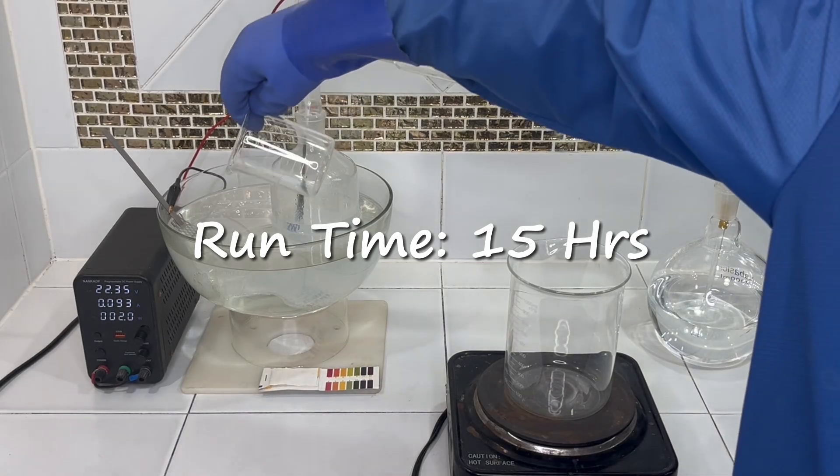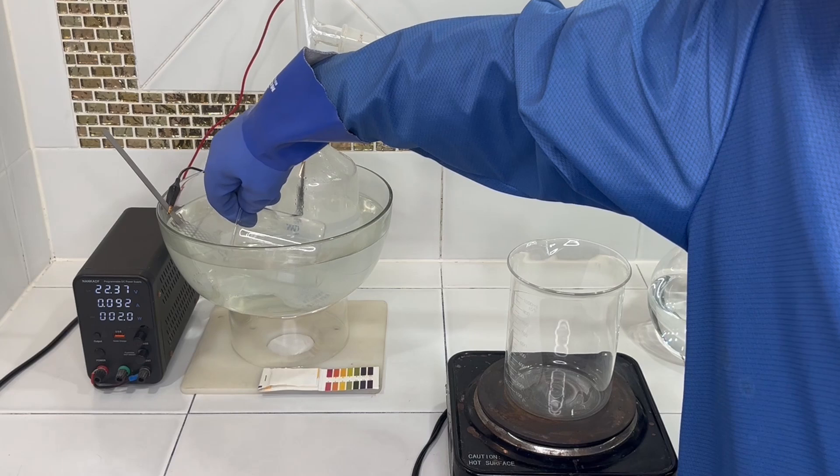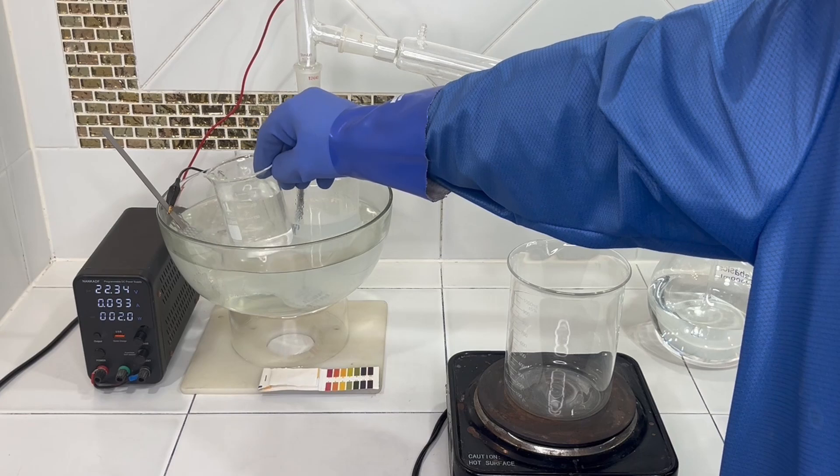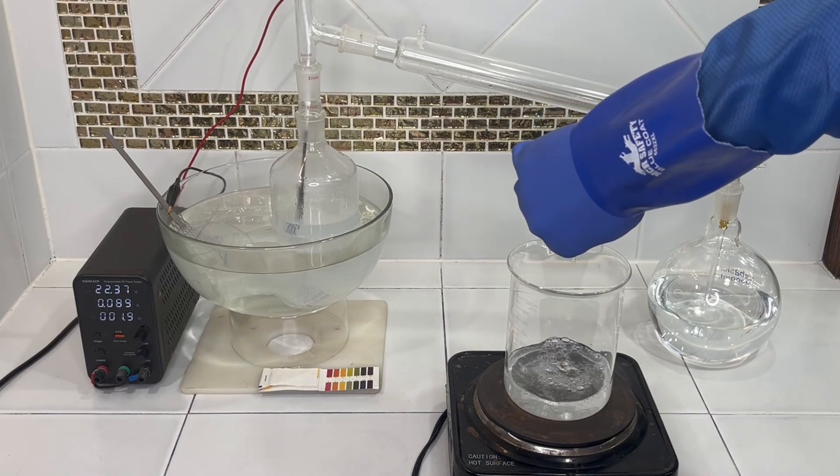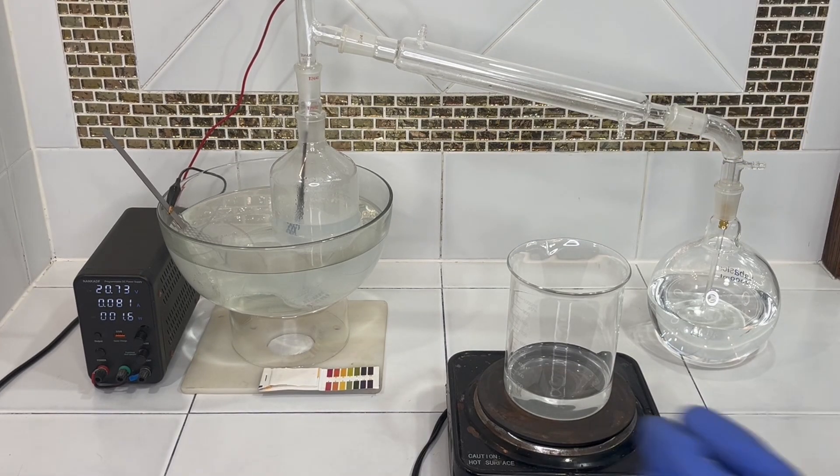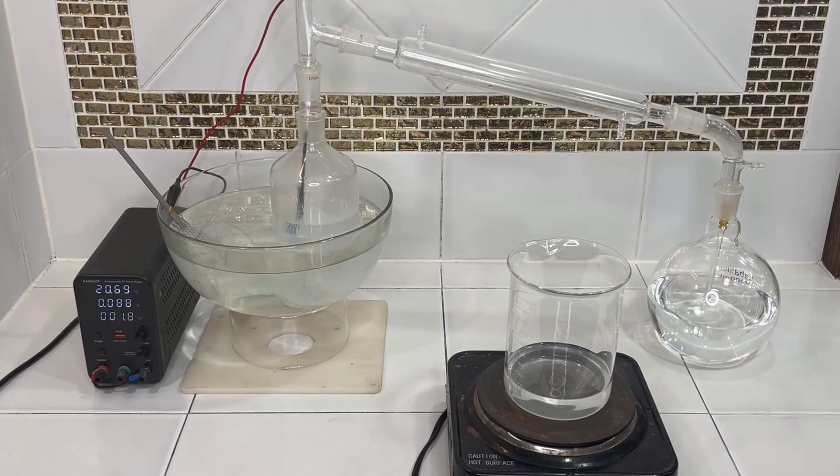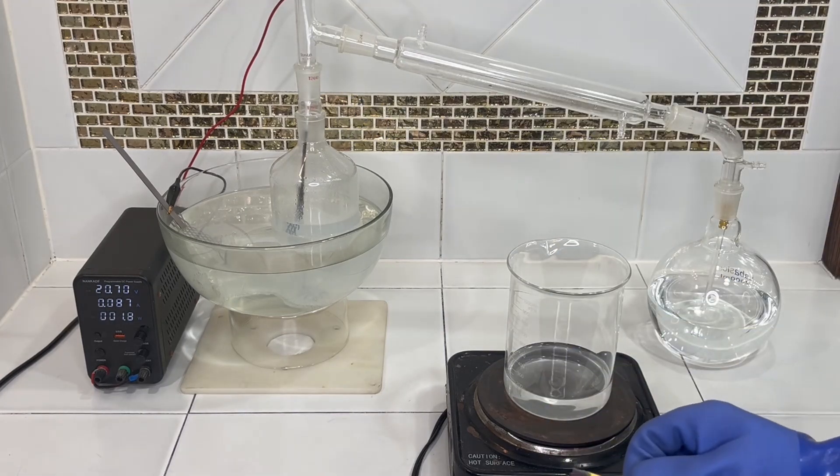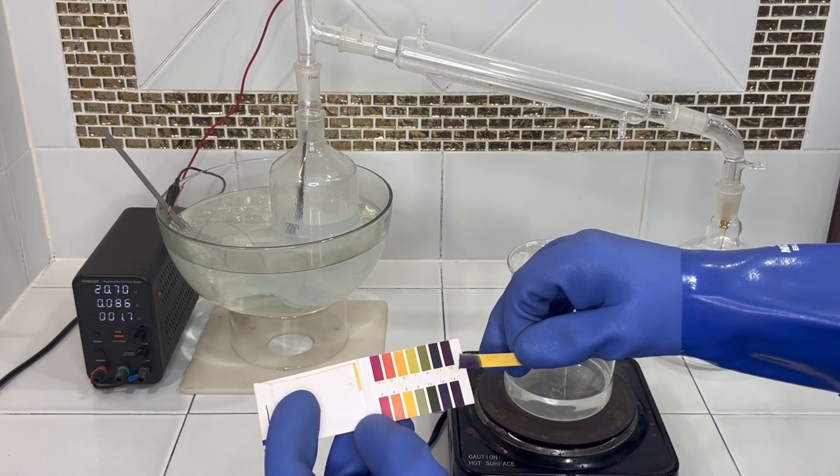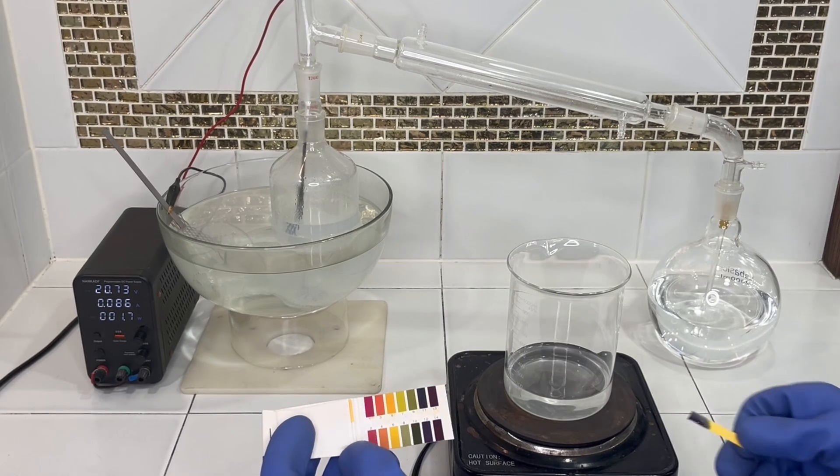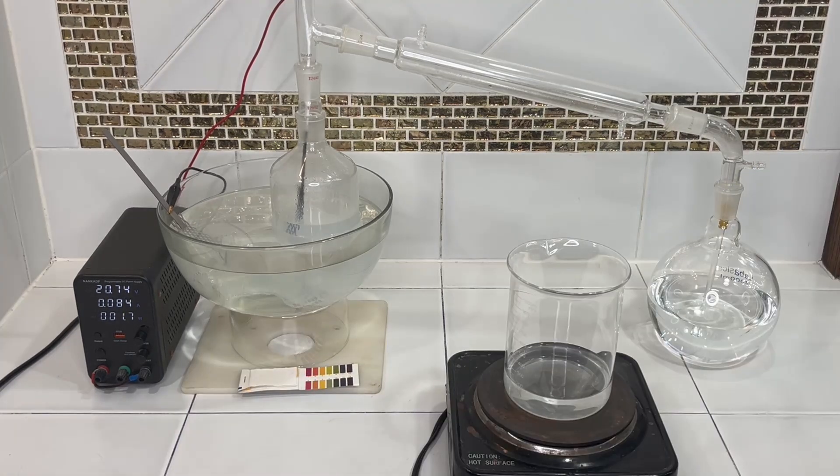So our solution will be fairly dilute at this point. I'm going to pull out about 200 milliliters, and we're going to evaporate off some of the water and concentrate our sodium hydroxide. And while we're doing that, I'm going to take a final pH test. It looks like 13, 14. So we're going to have a highly basic solution. Then we'll get this evaporated down to get our dry sodium hydroxide.